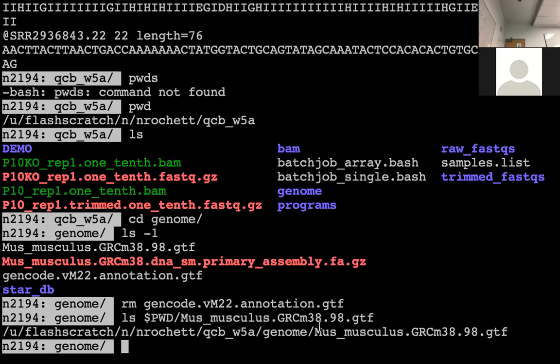No, this is everything, it's all in there. But just so you know, currently you're here, and what you need to do is go to there, and then you're going to replace... So this is now, you're in your directory.